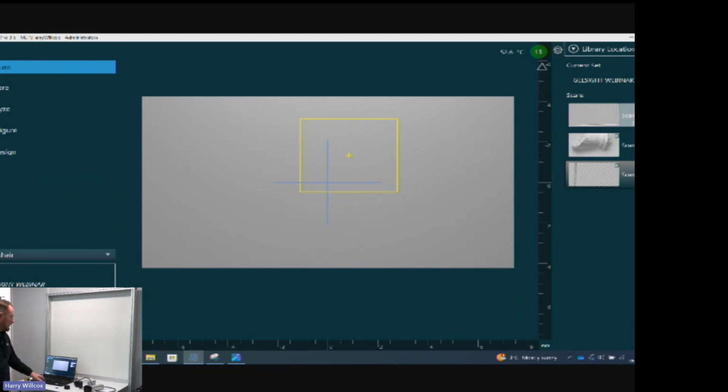So you see on the right-hand side here, it's generating the 3D data. On our Gelsight Max system, we're obviously taking a considerable amount more points, so we tend to see that the processing time is slightly longer. On the Gelsight Series 2, I like to try and get the systems to work to about 5-second processing. On the right-hand side here, you can see I've got a green boundary. That green boundary is telling me that the routine is passed.